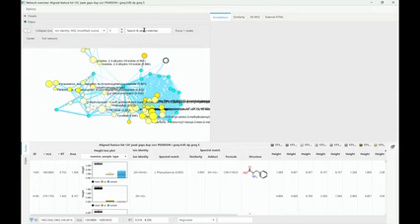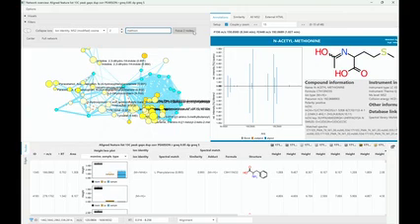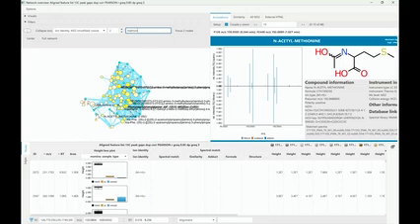So if we rather want to find something here, I could also just search and say, I want to search for methionine, because I know that there's a methionine in here. I can click on this focus on two nodes. So there's two features actually with something methionine. Yeah, you can also not specify it too much and then basically have a match to just methionine here. And now again, it's quite dense, but we can filter it down. So there's the number of neighbors I want to see.